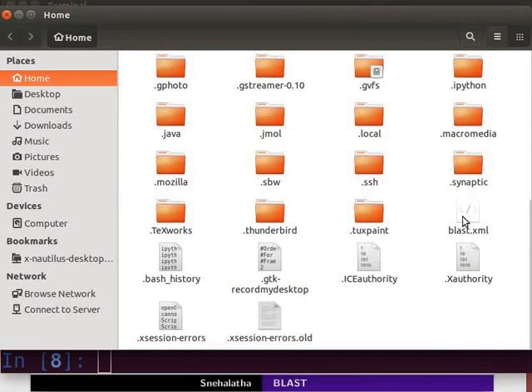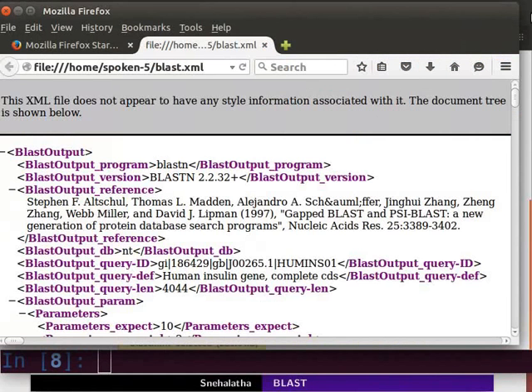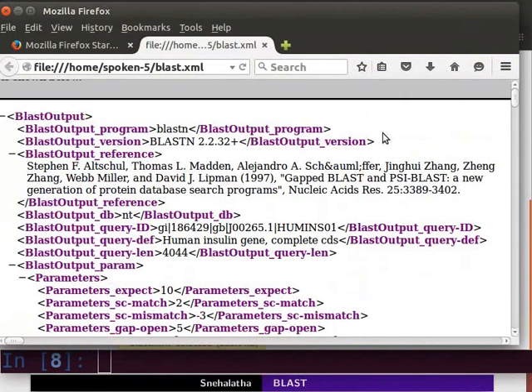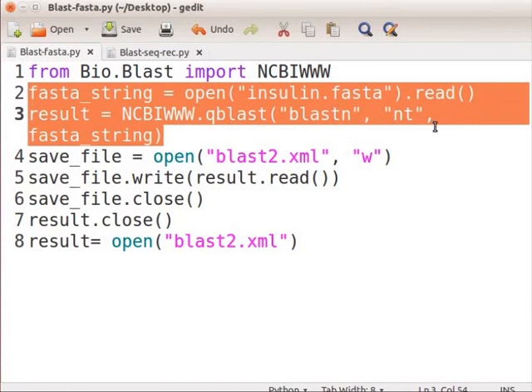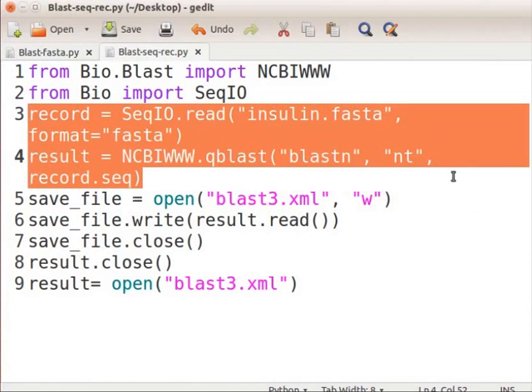Navigate to your home folder and locate the file. Click on the file and check the contents. Use the code shown in this text file if you want to use a FASTA file as a query. Here is the code if you want to use the sequence record object from a FASTA file as a query.